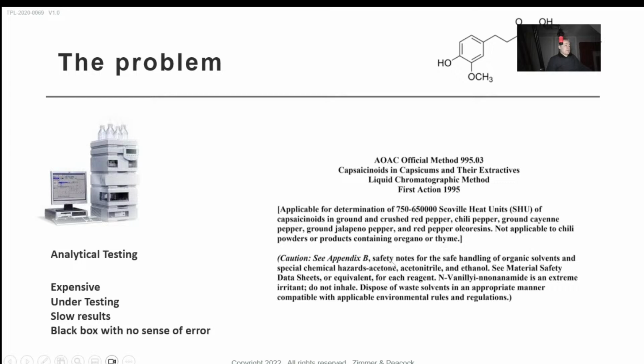And I think in particular for these hot methods, this is the AOAC official method. They're not actually validated to run particularly hot powders. So if you look at the AOAC method, and I should say that there's an agency for analytical standards in India for the food industry, they also follow the AOAC method.